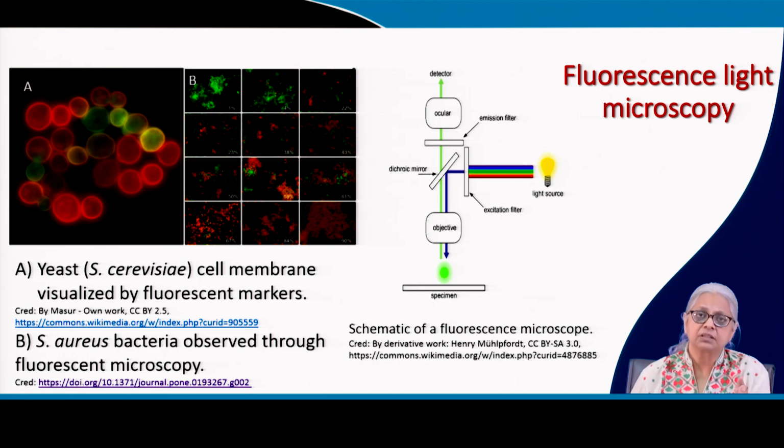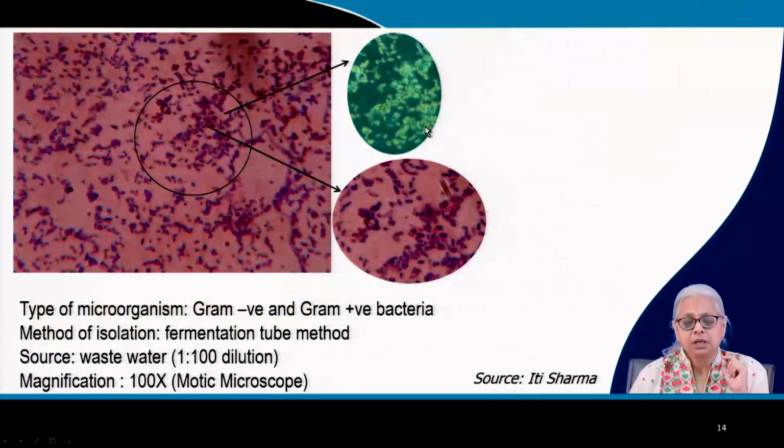We have specific filters and specific dyes, and the combination of the filter and the dye will result in different colors. So coming back to this, we can see that the colors are a little more obvious. Here purple and pink are not so easy to differentiate. Pink is so light in comparison to purple that everything looks more or less purple. So here you can see there are yellow orange colors and a faded green color.